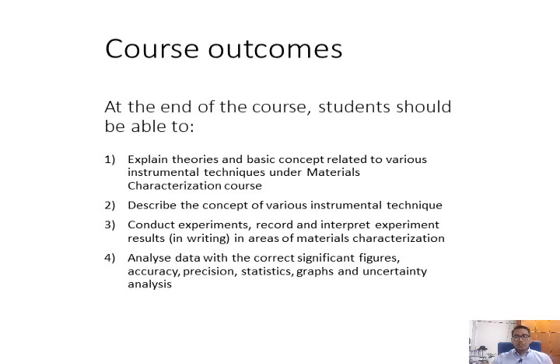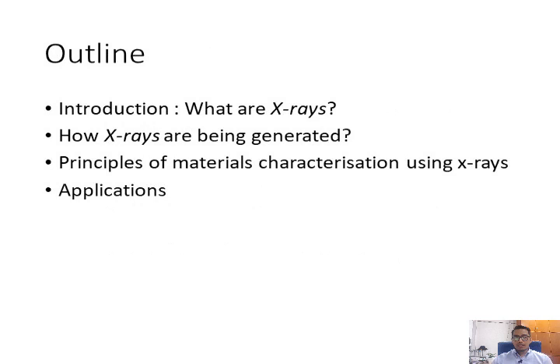And the outline of our lecture today is to introduce what X-rays are and how these X-rays are generated, followed by the principle of material characterization using X-rays and some related applications that use X-rays as part of the instrumentation.